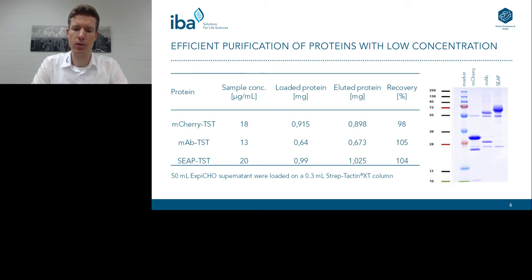However, you can also see 2 contaminating bands in every elution, and the band profile looks quite similar to the profile of an antibody. Actually, the supernatants provided by Thermo were from Expi cells that already overexpressed a human antibody at a very high titer, around 3 grams per liter. So this is a kind of artificial contamination, which is usually not present in the Expi supernatant.